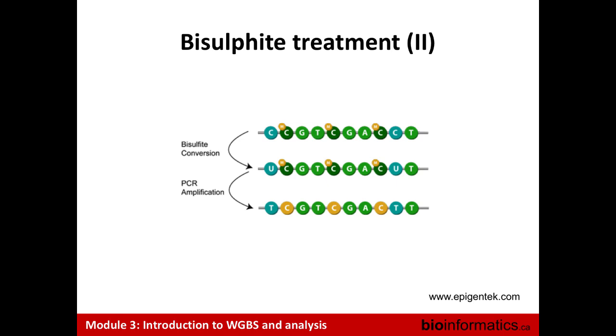Is there any technology that can identify only the C which is hydroxymethylated? I think there are. There's a variant of the bisulfite treatment that allows you to distinguish the hydroxymethylated versus the methylated Cs. But then you have to do the two experiments if you want to really distinguish the two. So this is just a crude approximation.